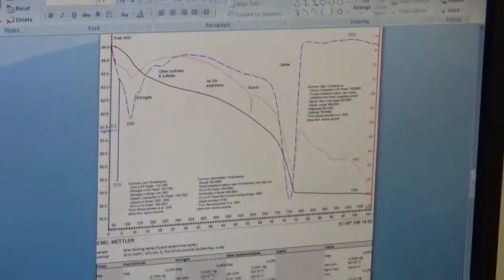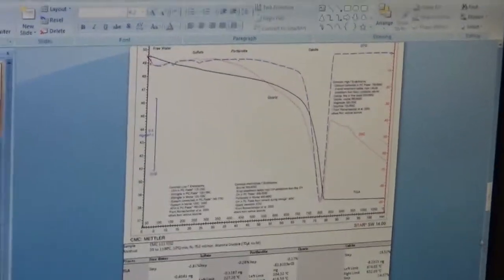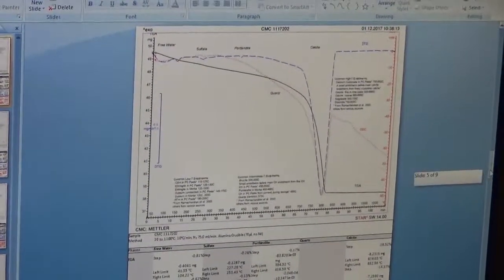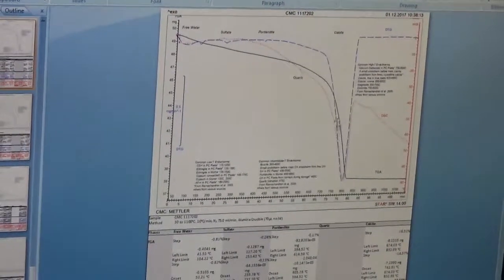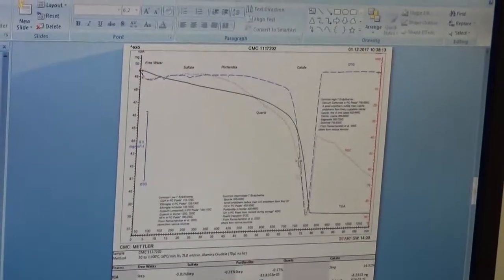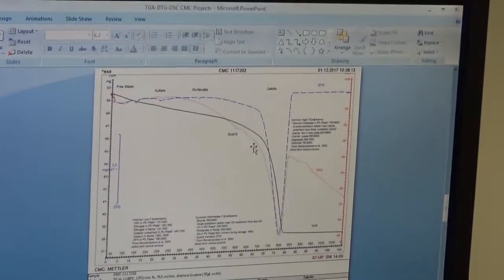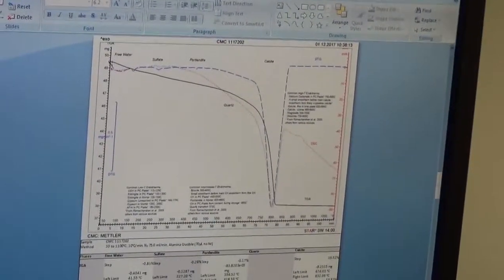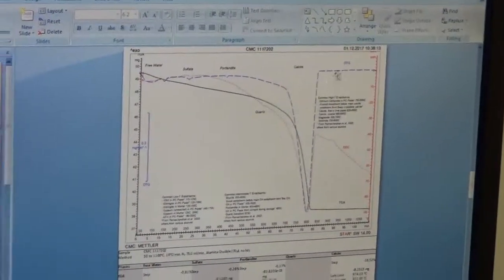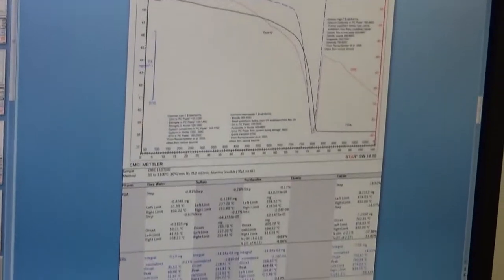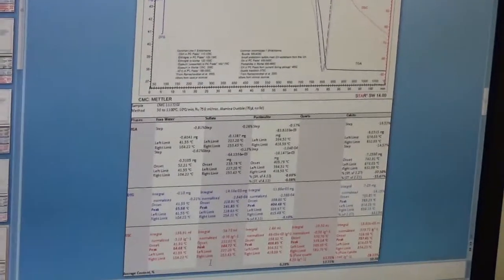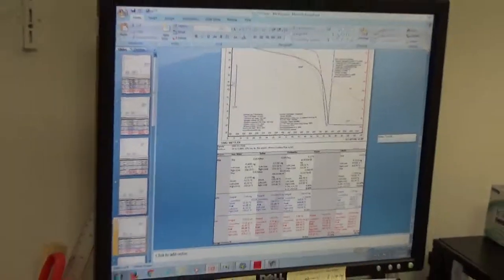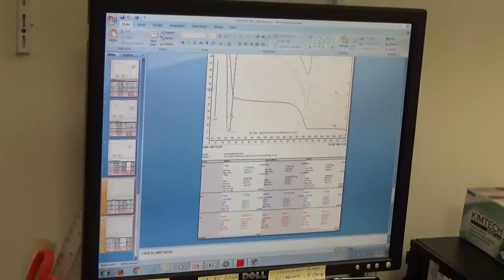This one is a lime mortar — mostly a lime mortar. All you have is calcite from carbonated lime matrix — the main endotherm of calcite — and then quartz from the quartz sand. It also shows some Portlandite in the lime matrix. This is how the data is represented: we give the TGA and DSC scans, then give the data at the bottom, and show the quantitative calculation of different phases based on the amount detected in the TGA, DTG, and DSC scan.